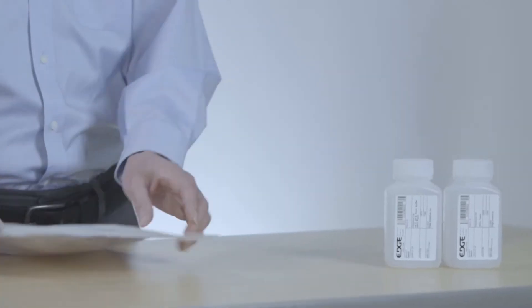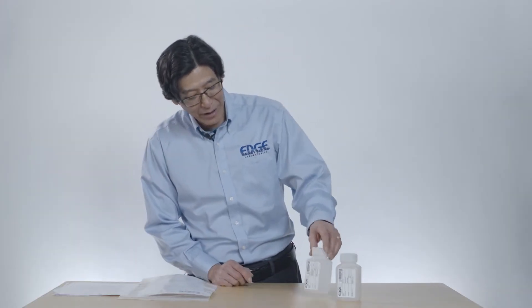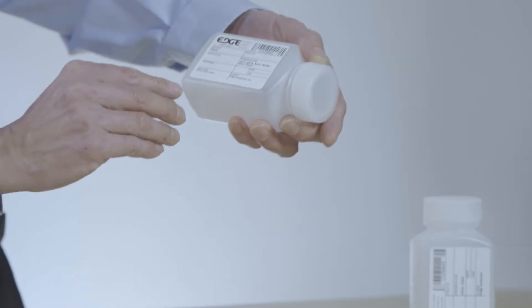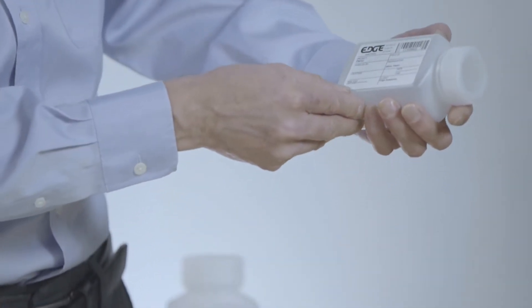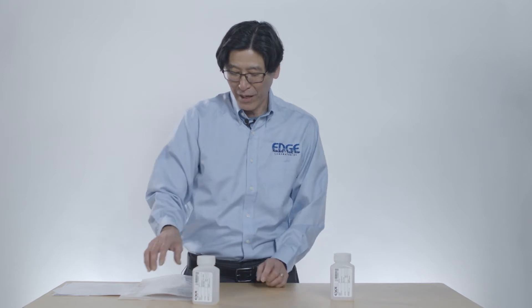First thing we do is we get a sample kit. One part is a bag with some of the stuff we need for our sample, and we have two bottles. These two bottles are labeled in very small print — one says filtered and the other says unfiltered. We're going to fill the unfiltered bottle completely and then use our sampling kit to filter the sample into the other bottle.